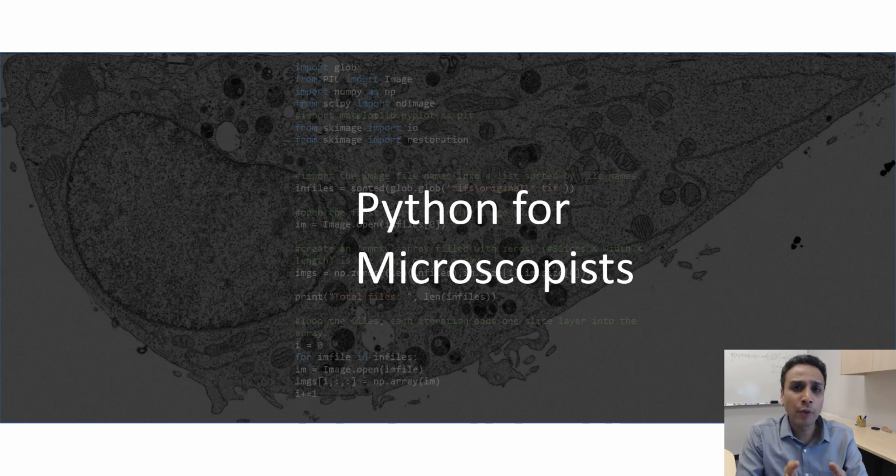Now, the reason why we need histogram equalization is, for example, if you collect images that look like they're washed out. Oftentimes we collect very low contrast images on microscopes for whatever reason. It could be the nature of the sample. Sometimes it's just that we haven't set up the brightness and contrast settings on the microscope properly, or sometimes they just drift. Whatever the reason, with histogram equalization, you can stretch the histogram to span the entire range.